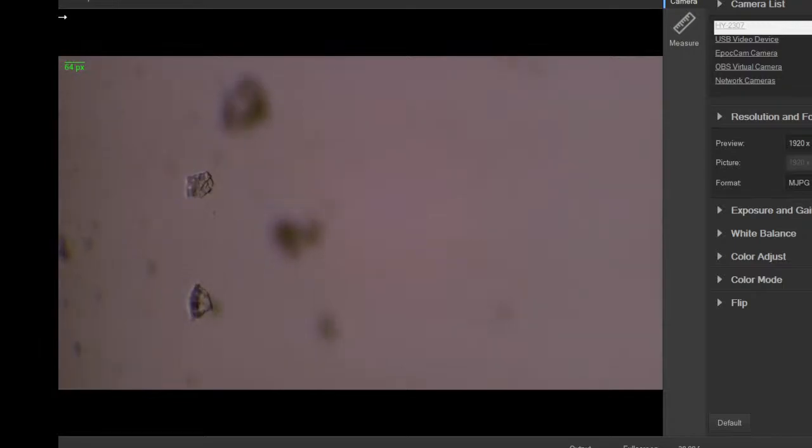So this one's off the cover slip. You can see the thickness of water there. It's kind of blurry. And he's going in and out of focus as the water is thicker. Makes it very challenging. That's two good things so far. What else we got?